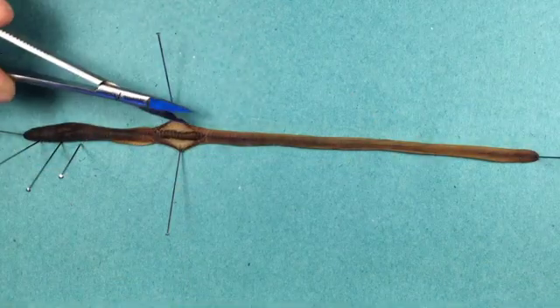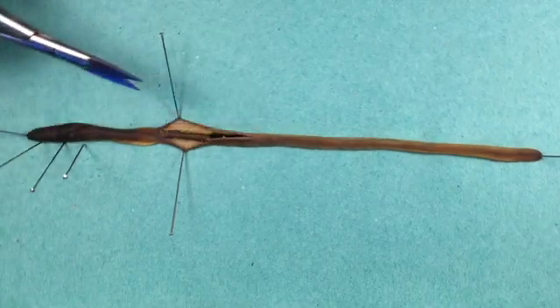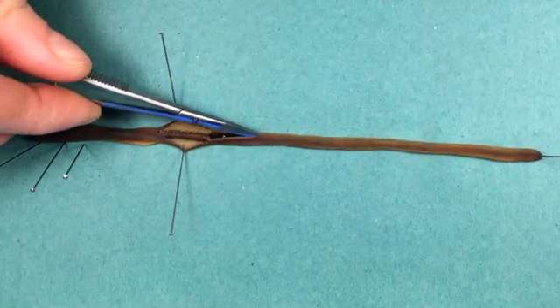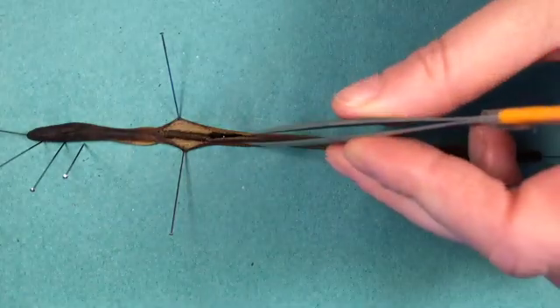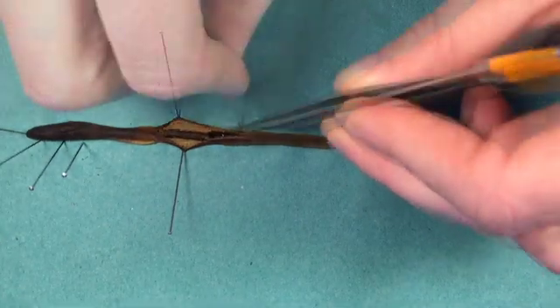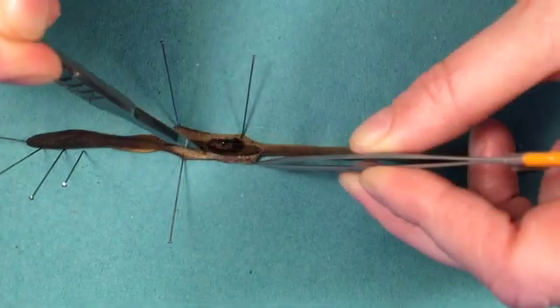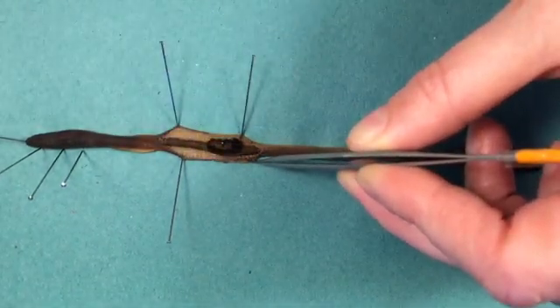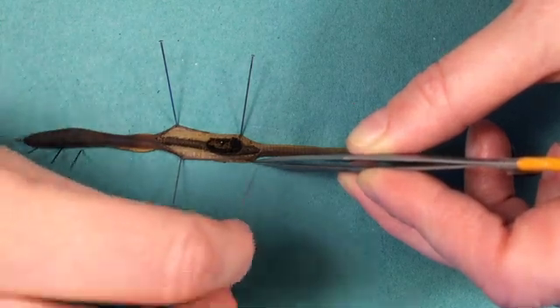Continuing down the worm, snipping again — keep it very shallow, about 2cm at a time, certainly no more than that. I think I've just caught the gut slightly there; not a huge problem with a preserved specimen but it means I have to be a little bit more careful. I cut a little bit deeply there — you can see I've ruptured the gut, and the gut of course is full of humus that the earthworm has been eating.